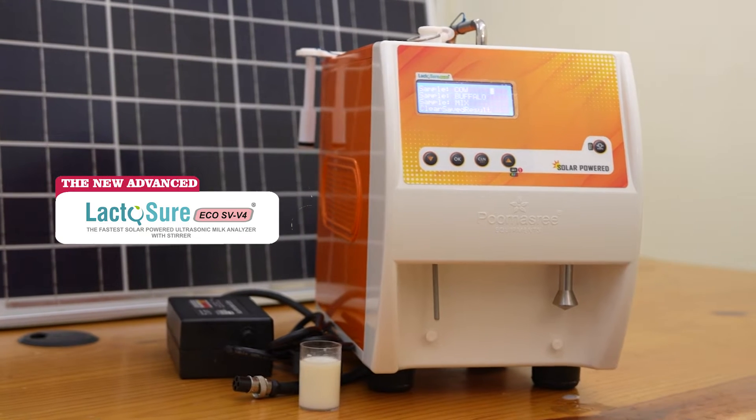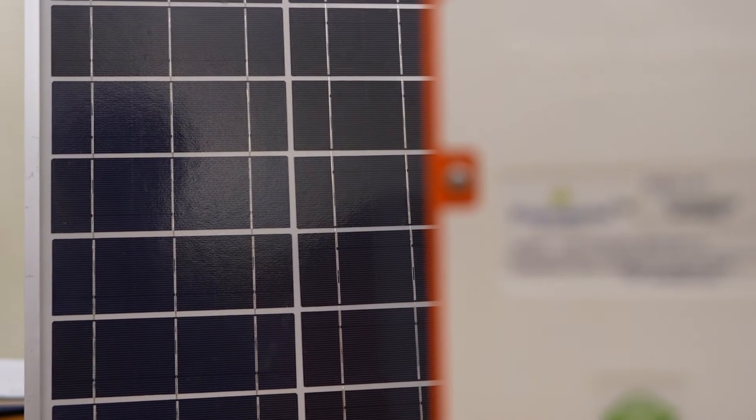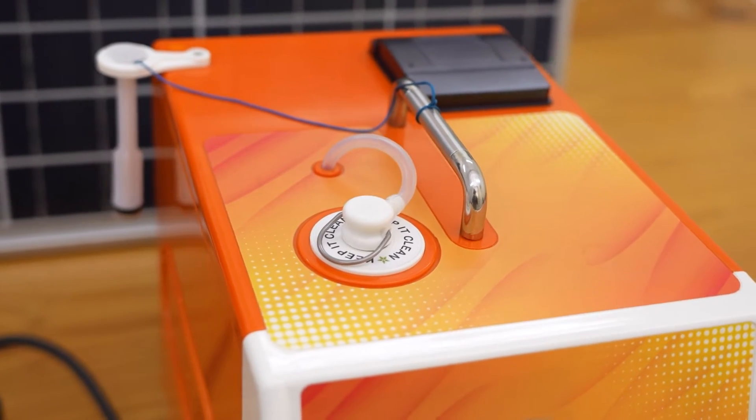Lactosure Eco SV is the most accurate and fast solar powered portable analyzer plus terro combo that is currently manufactured in India.